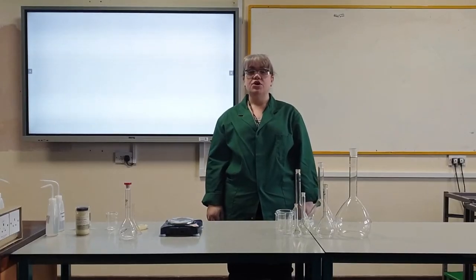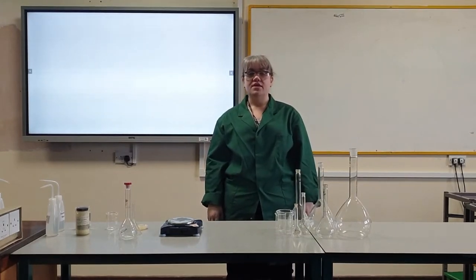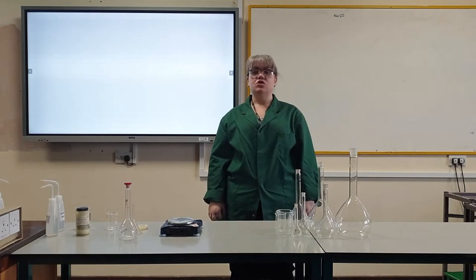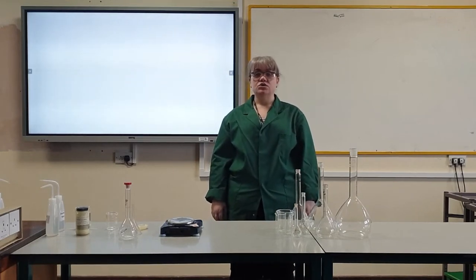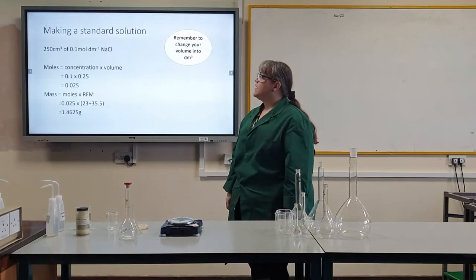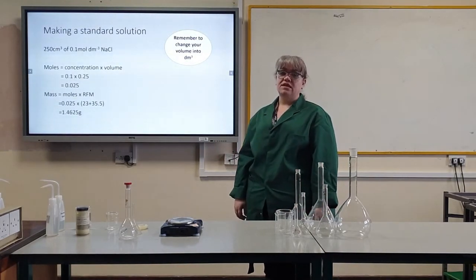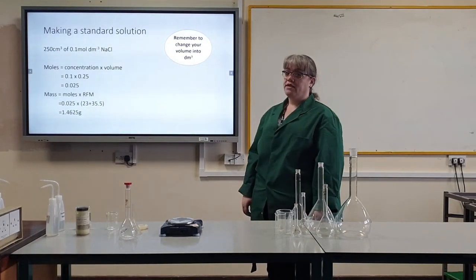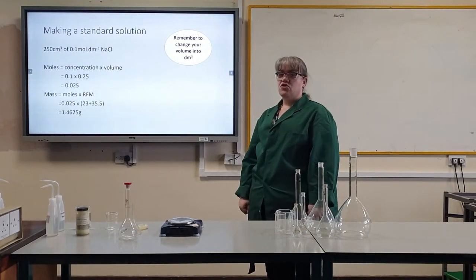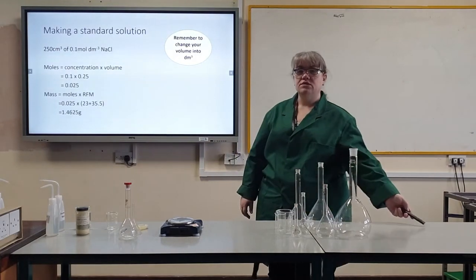Hello, today I'm going to show you how to make a standard solution. Before you get your equipment ready, you need to calculate the mass of solid you will require for your concentration and volume of solution. I am making 250 centimetres cubed of a 0.1 moles per decimetre cubed concentration of sodium chloride. I've done my calculations and I need 1.4625 grams of sodium chloride.